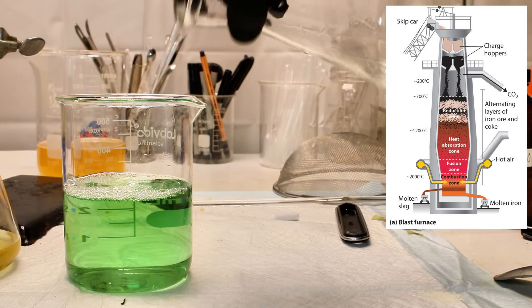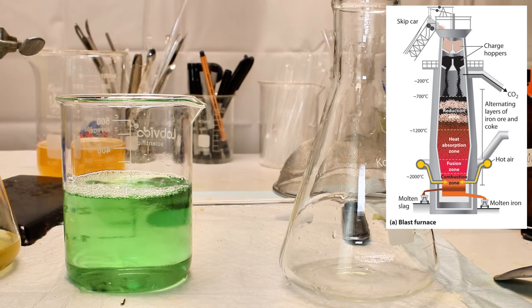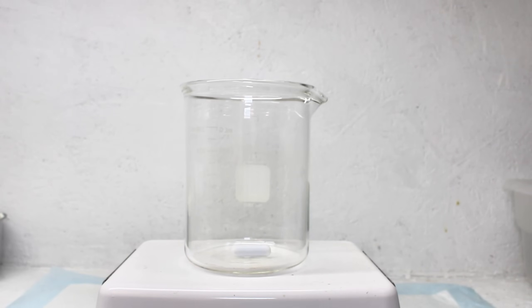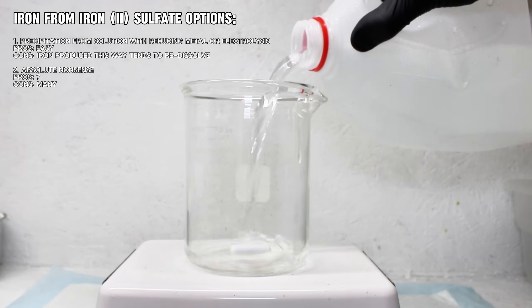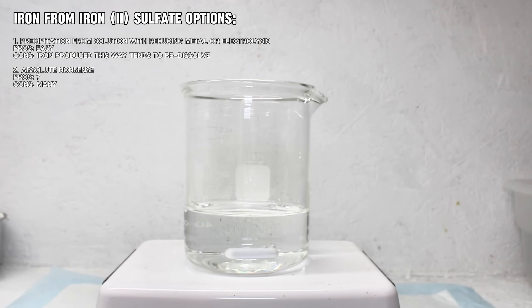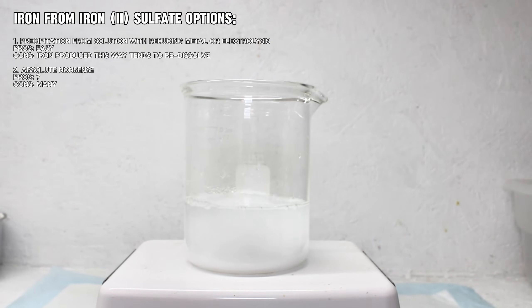Needless to say, the importance of this chemical process cannot be understated, but I really didn't feel like recreating it myself. To that end, I first considered precipitation with aluminum, but I've done that before and it's never very efficient due to the iron redissolving in the acidic solution. I then considered electrolysis, but abandoned the idea for the same reason. In the end, I settled on the thermal decomposition of iron oxalate, which was needlessly complex but a very interesting process.